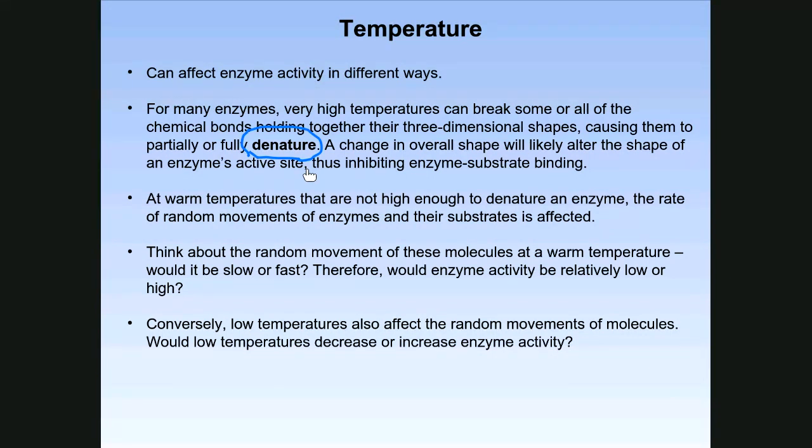So in the case of today's enzyme, one of your three experiments has to do with temperatures. You will expose this enzyme to 4 different temperatures: 0 degrees Celsius, room temp 22 degrees Celsius, body temp 37 degrees Celsius, and 65 degrees Celsius. Now in table 2 in the lab procedures, I've given you data associated with the amount of product the enzyme is producing over a duration of 120 seconds or 2 minutes.